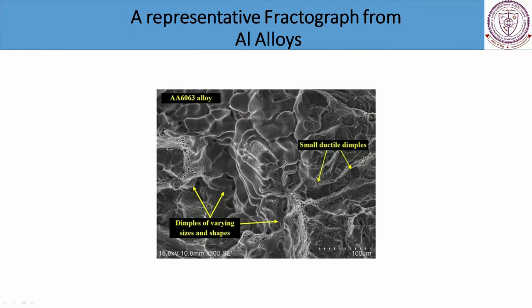Now we shall be going to the next slide. This is how any ductile material will look. All metals are ductile materials, meaning they have the ability to deform permanently. So once you try to deform it and finally fracture the surface, they are going to fail or fracture in a ductile manner. Then this kind of feature you will be able to see, known as the dimple.